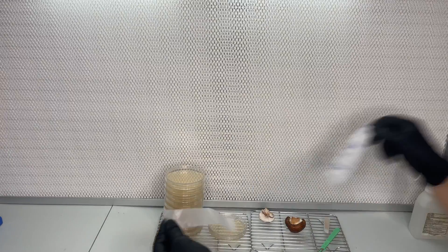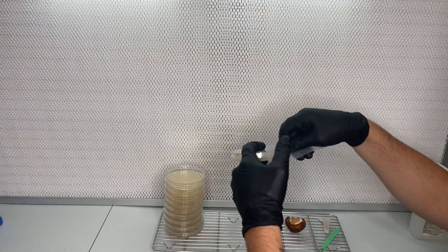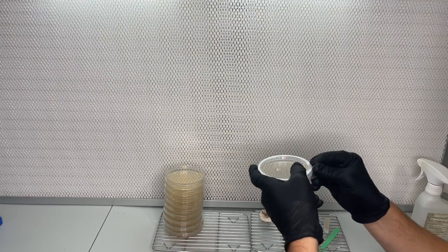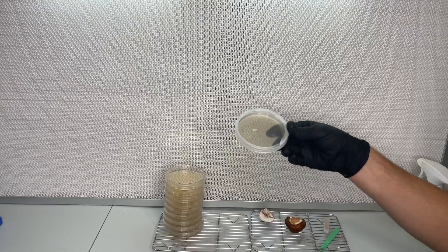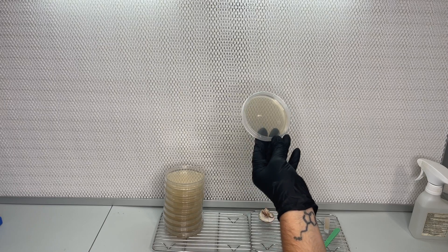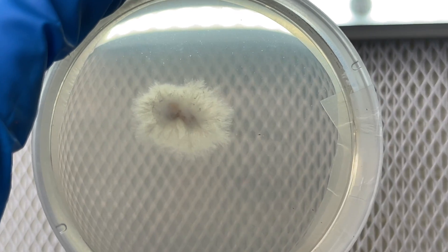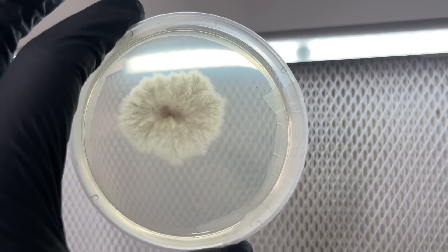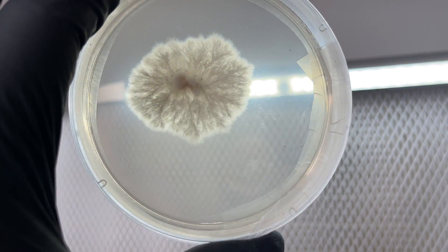After the transfer, I wrap the plate in parafilm and incubate at 75 degrees Fahrenheit for a few days. After a few days, I check to make sure the sample is clean and healthy. If it's not, I make more transfers from it to new agar plates and then let them continue growing until it covers the plate.